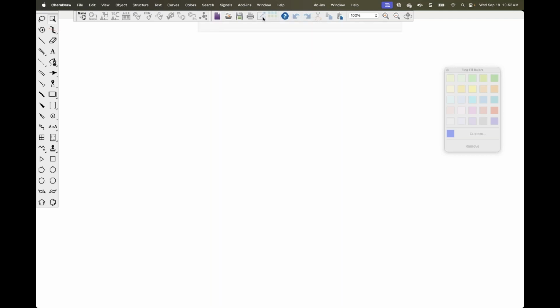And then I have this other icon, which I didn't show you guys, but it allows you, for anything that you've opened from the ChemDraw Plus application, to close that specific drawing and open it up directly in ChemDraw Plus to continue editing.